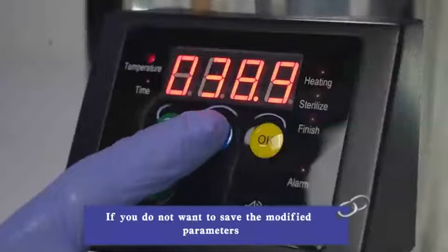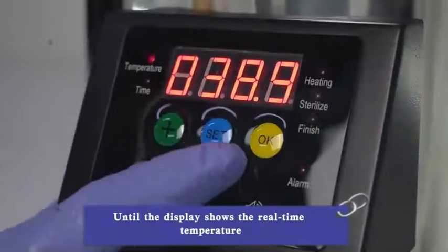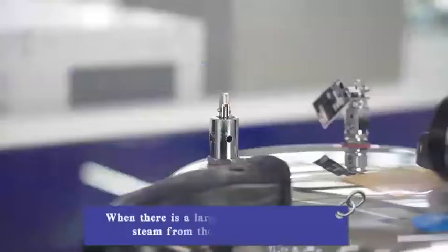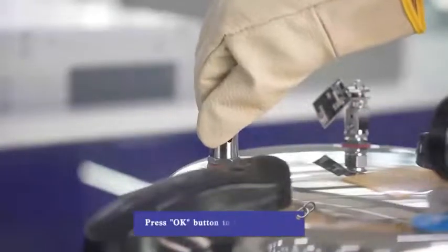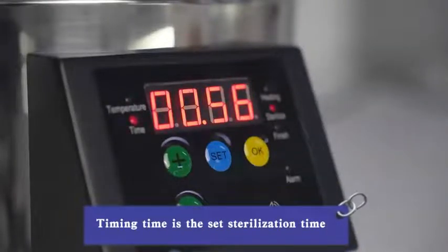If you do not want to save the modified parameters, continue pressing the SUT button until the display shows the real-time temperature. After setting the working parameters, press the OK button to start heating. When there is a large amount of white steam from the exhaust valve, close the valve. Press OK to start heating. When the temperature rises to the sterilization temperature, the display will automatically switch to countdown. The timing duration is the set sterilization time.